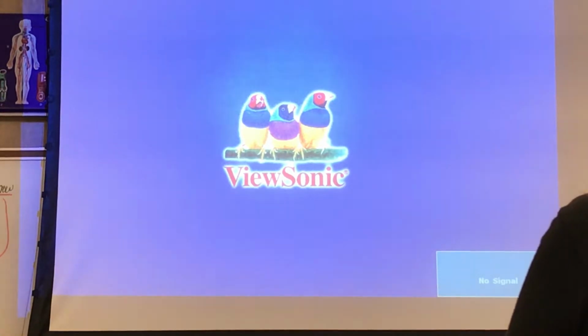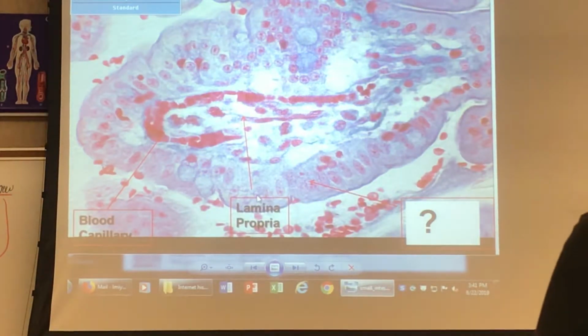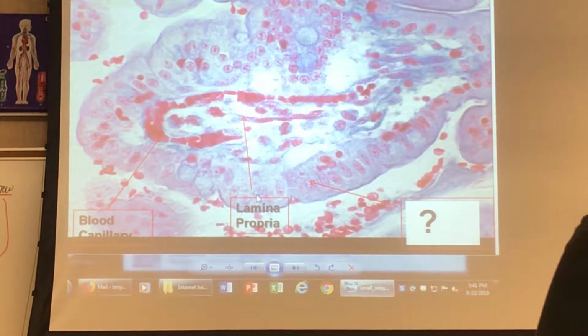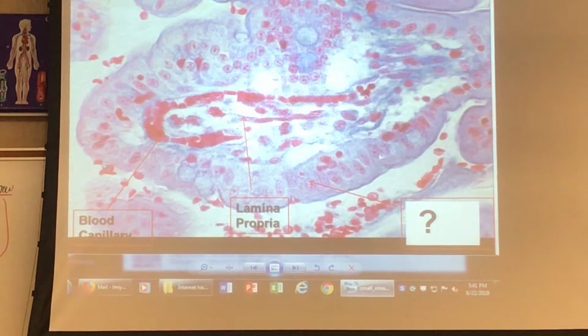Question B, what is the name of the tissue with the question mark? Do you see a basement membrane and a free surface? Yes. Does it look like it's lining anything? Like this tissue here, where the arrow is. Does this look like it's lining this thing right here? What is this out here? That's the free surface. This is tissue type number 1.